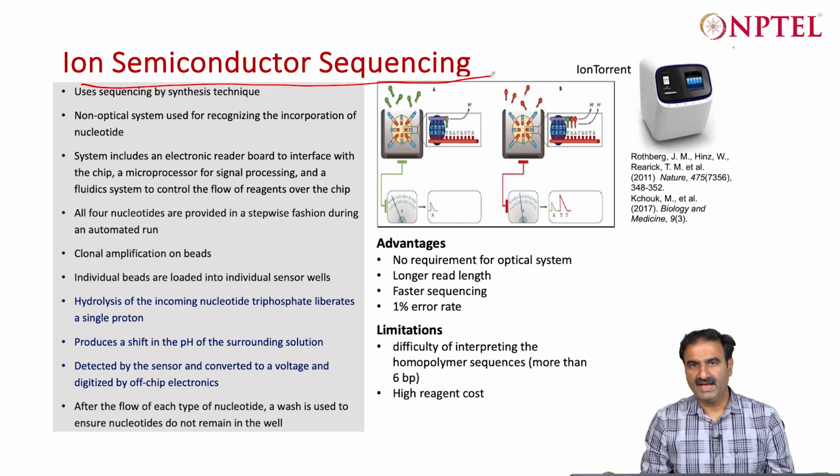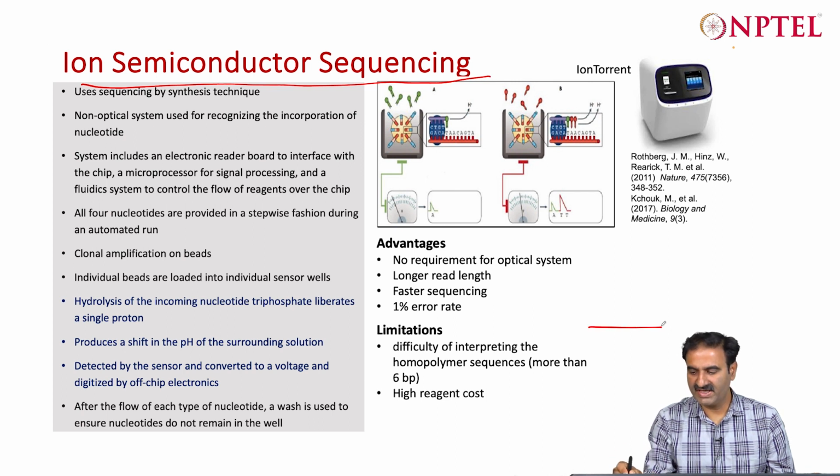So for every base pair that is inserted in the chain, whenever a nucleotide is inserted, basically it releases a proton, which can change the pH of the system.